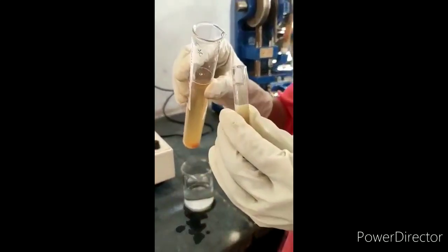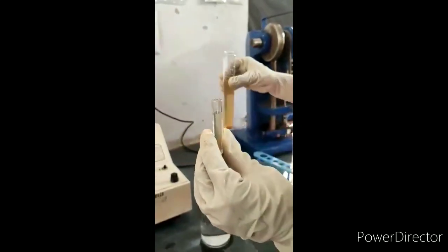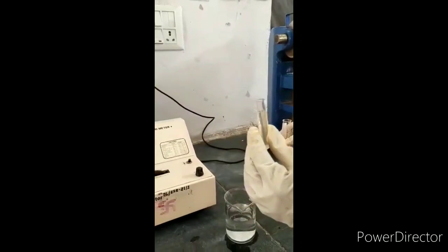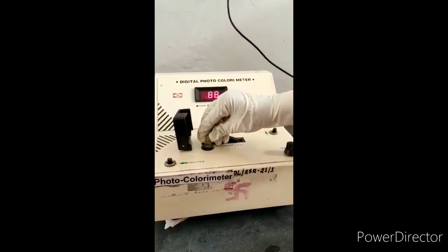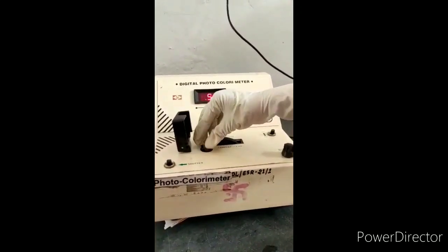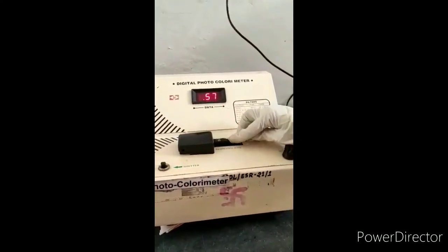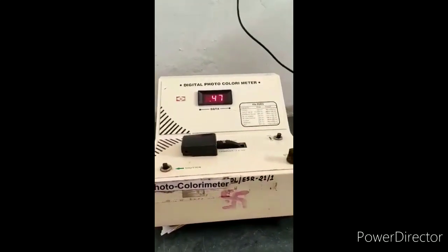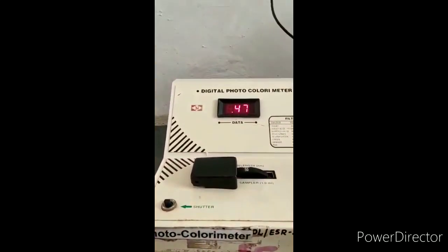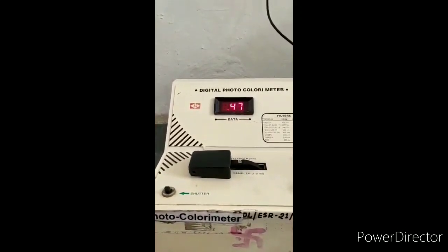Take the standard solution in the cuvette, i.e. 1 ml. Keep this cuvette in the sampler slot. Close it and adjust the filter at 500. Now this is the final reading for standard solution, i.e. 0.47.